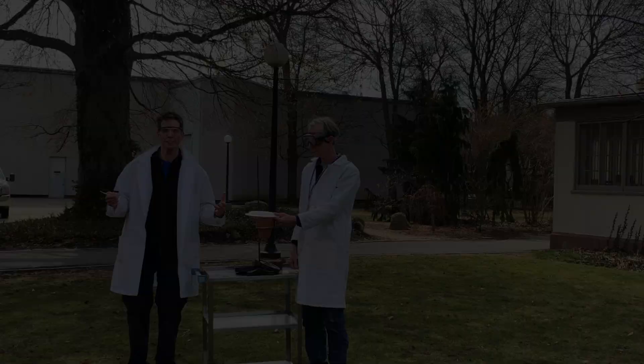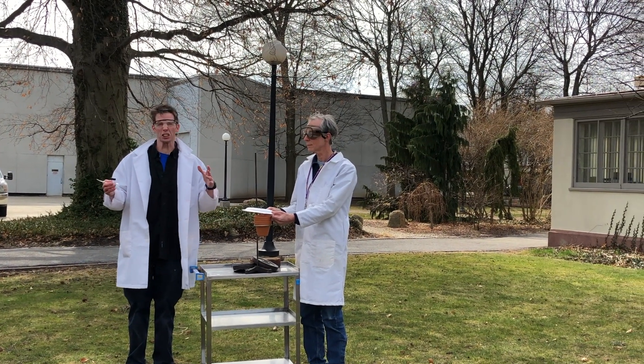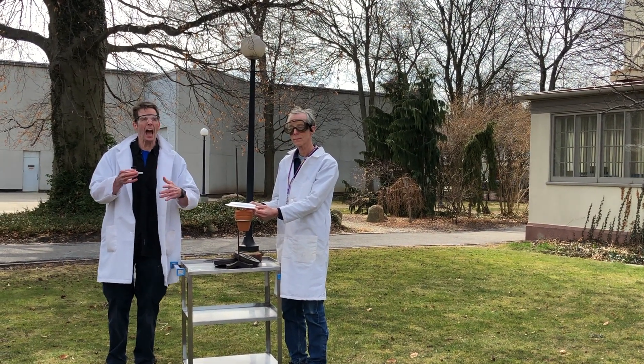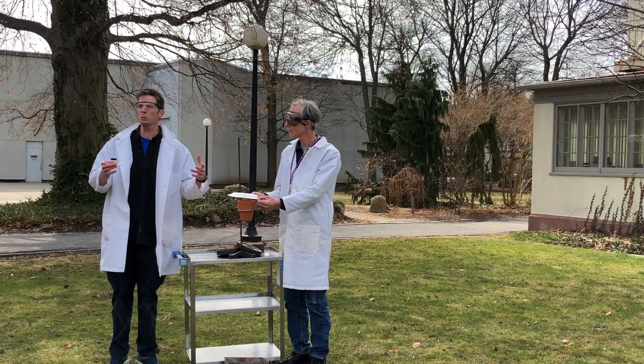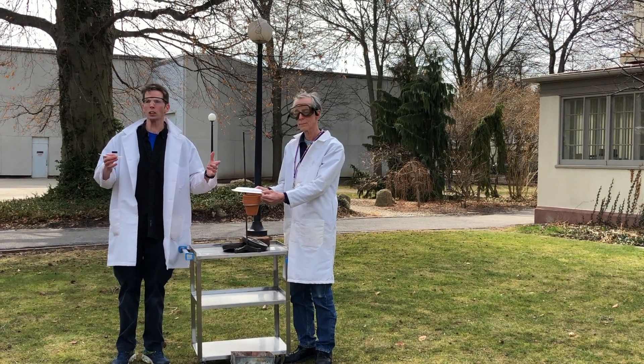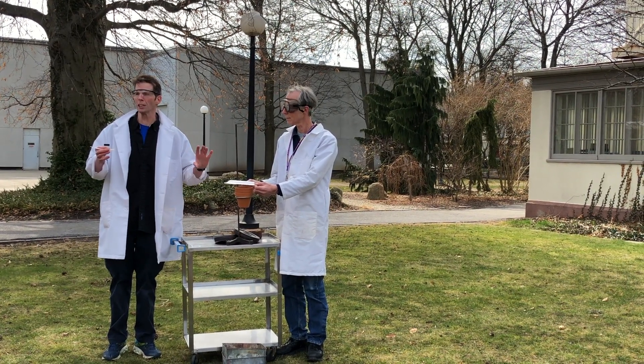Today it's thermite. Thermite's been around since the 1800s. It's a single exchange reaction — you take two different things and put them together and it makes a new thing. The two things we're going to use today: one is aluminum powder, or aluminium if you're from the other side of the pond, and the other is just iron rust.